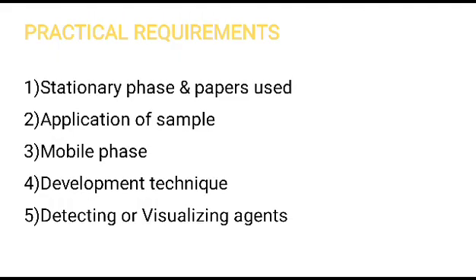Then what are the requirements? Which things are needed for the practical of paper chromatography? The stationary phase, that is the paper. Then sample application, mobile phase, development techniques, and detecting or visualizing agents.